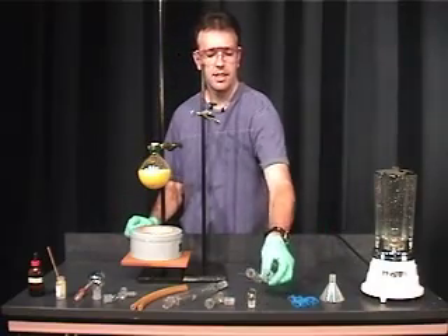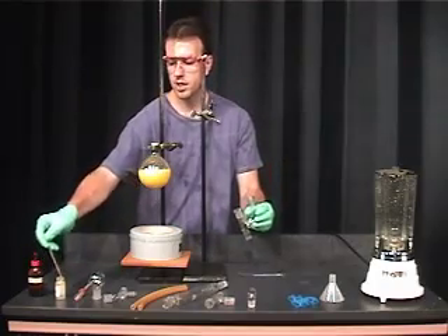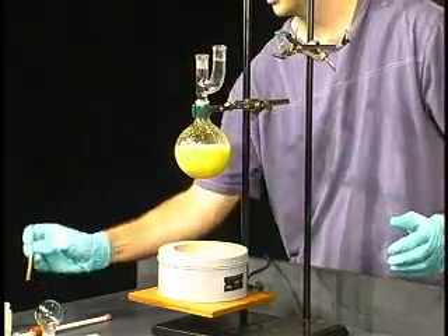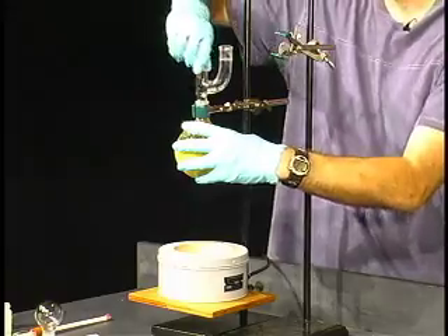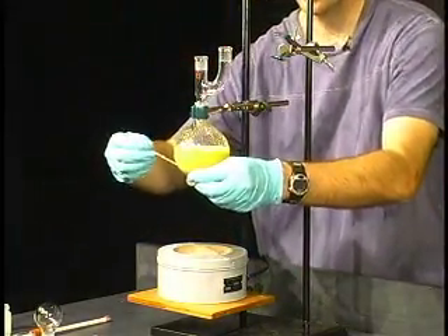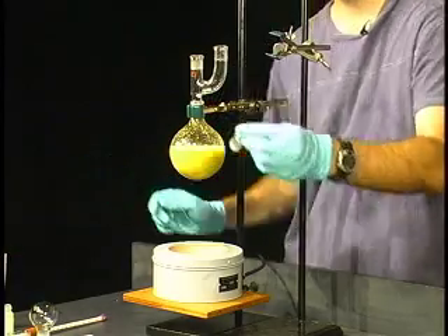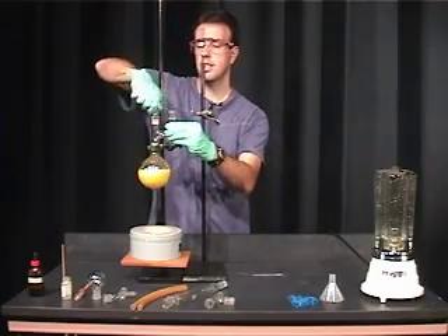The first piece of glass we're going to add is our Claisen adapter. We have to grease the joints here, add it in there, and spin it around. Same thing with the stopper — we want to grease the stopper which goes in. The reason we're adding the Claisen adapter is that just in case we need to add more water to this solution. Put that in and spin that around.